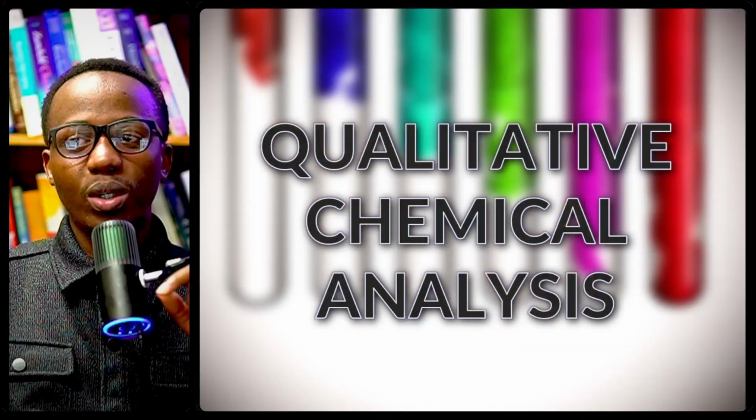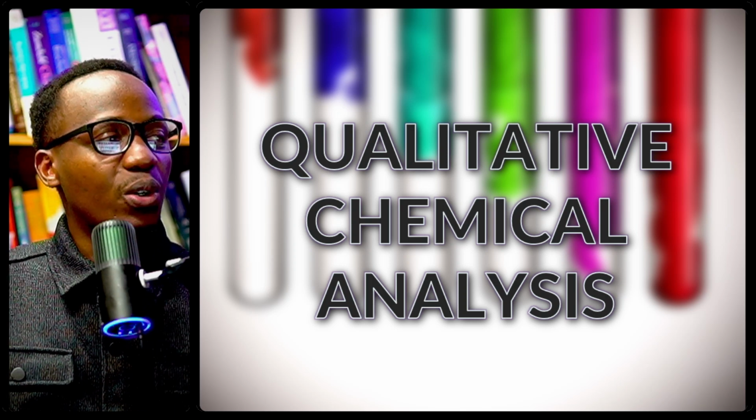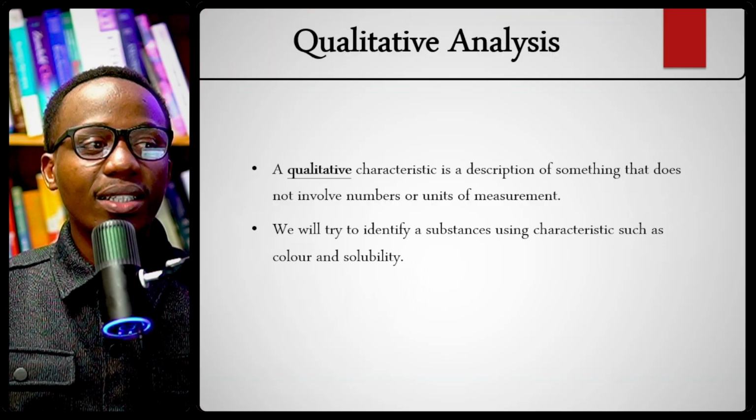And then, quantitative analysis is when we get to measure and see how much something weighs, what's the temperature, and so on and so forth. So, qualitative analysis is very important in chemistry. So today's lab is going to look at qualitative analysis.